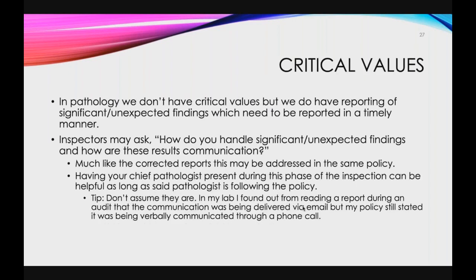Critical values. In pathology, we don't really have critical values, but we do have reporting of significant and unexpected findings, which need to be reported in a timely manner. Inspectors may ask, how do you handle significant and unexpected findings, and how are these communicated?